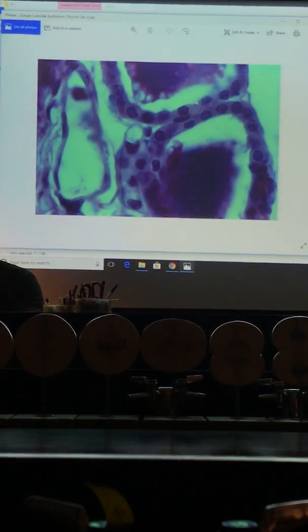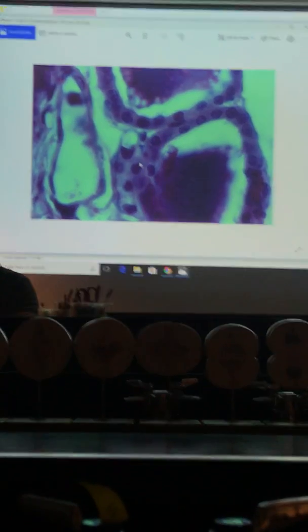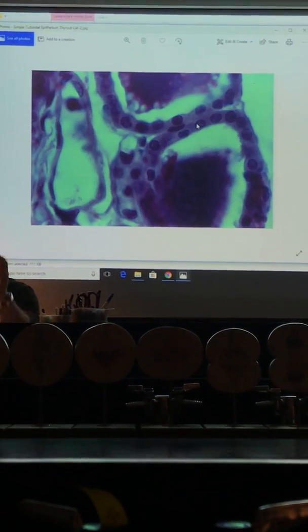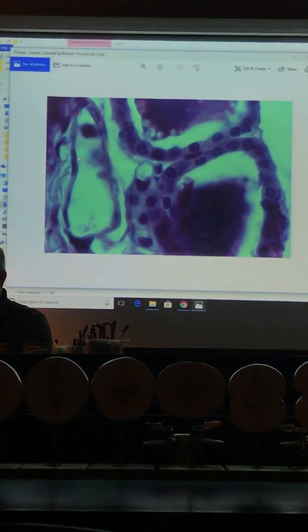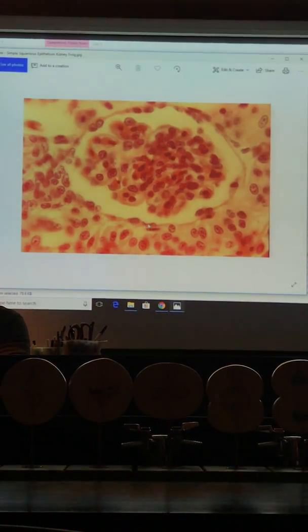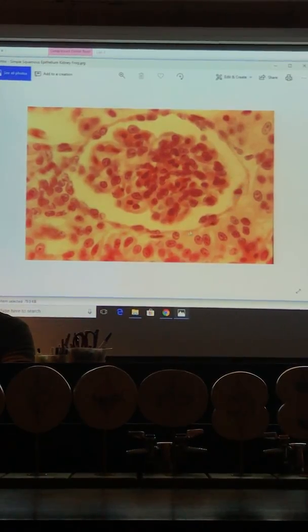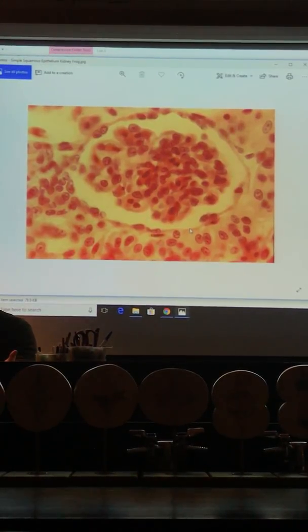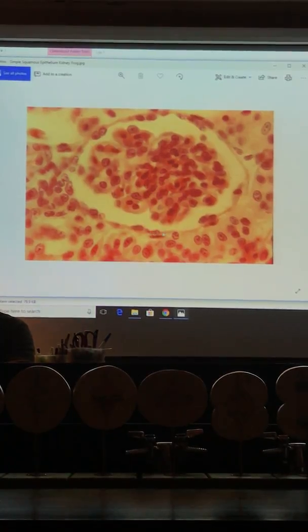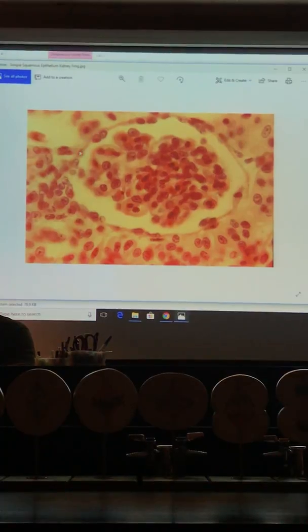This is neat. This looks like it's stratified, but it's not. These are 2 tubes, actually 2 structures, the follicles cut basically. So this is simple cuboidal epithelium. You see how that looks like an egg? This is simple squamous epithelium, not labeled on the slide. This is a better example. See this parietal layer? Remember visceral and parietal we already talked about today? This parietal layer in the kidney glomerulus that you don't need to know is the kidney glomerulus. But they look like fried eggs. This is an example of simple squamous epithelium or simple squamous epithelial tissue.